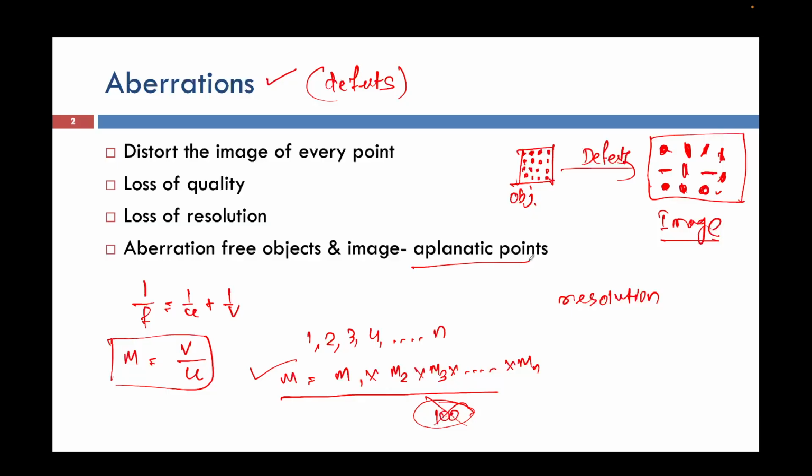Okay, so our job is to make sure that these defects are as minimal as possible, and they should not affect our image quality, because the moment they start affecting our image quality, your image will be distorted. You will not get clear resolution.